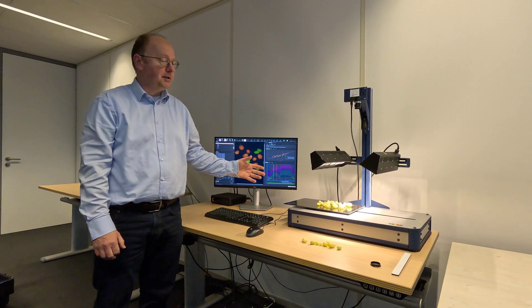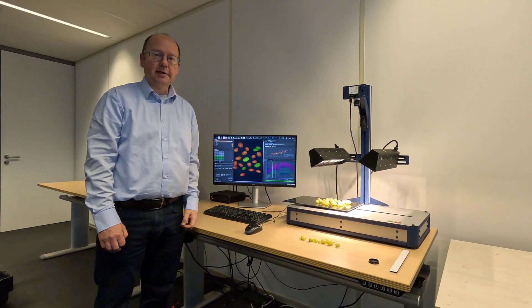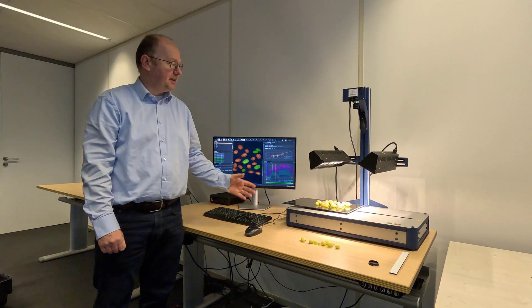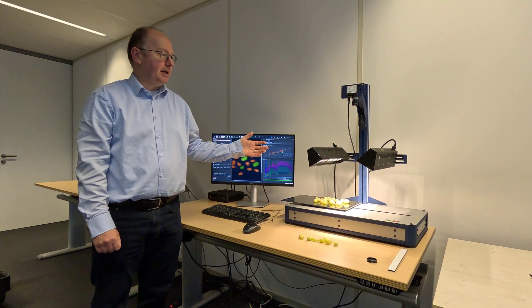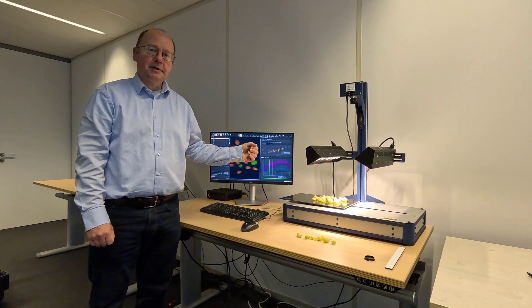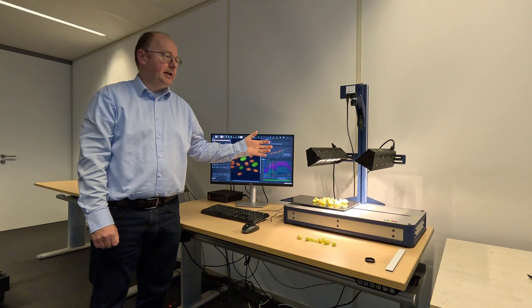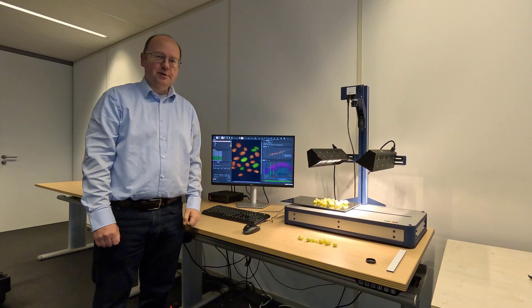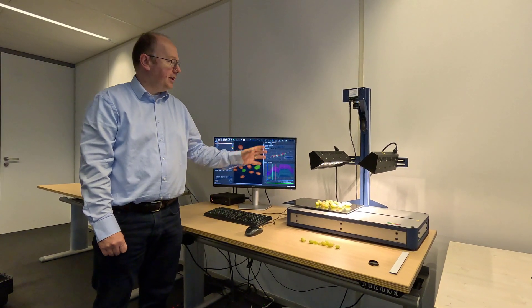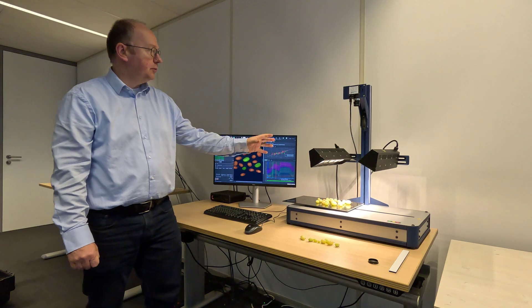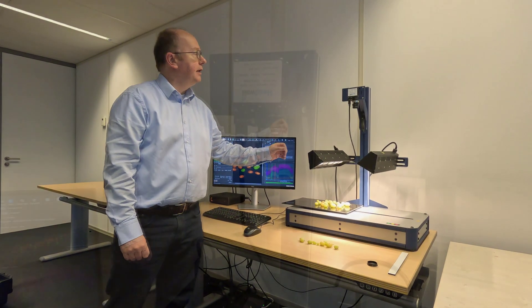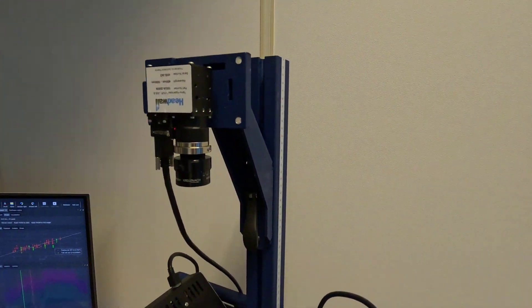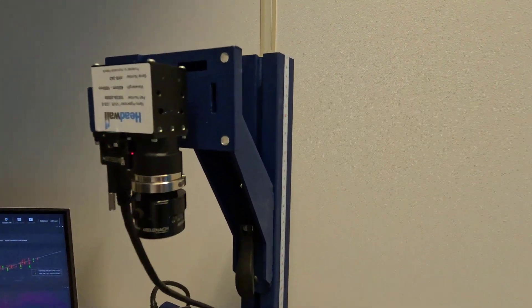Earlier this year we brought to market PerClass Mira Stage. It is a lab scanning setup that can be used to quickly acquire high quality scans, interpret them and validate these solutions. Here we have the stage mounted with halogen illumination and Headwall MVC VNIR hyperspectral camera.